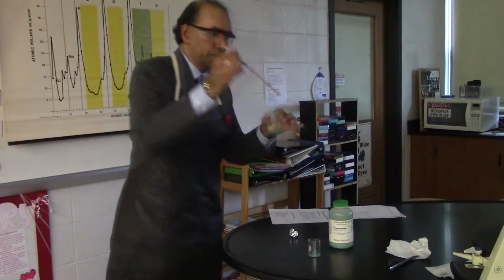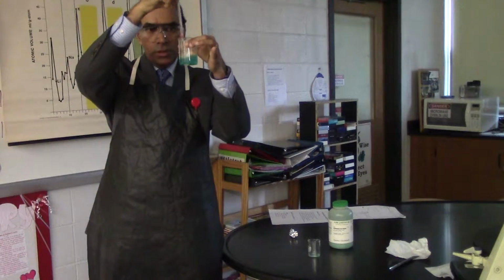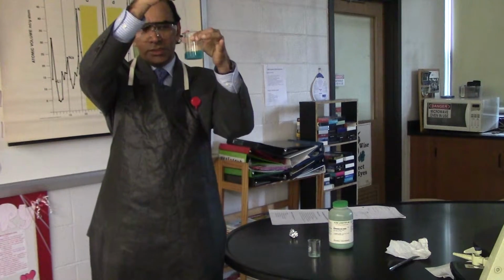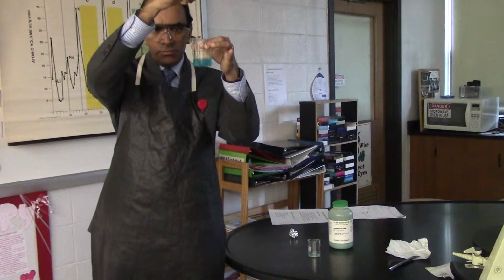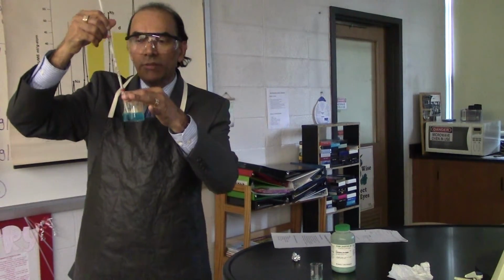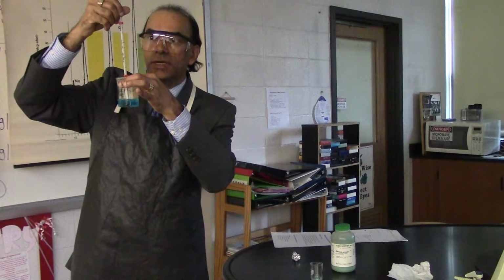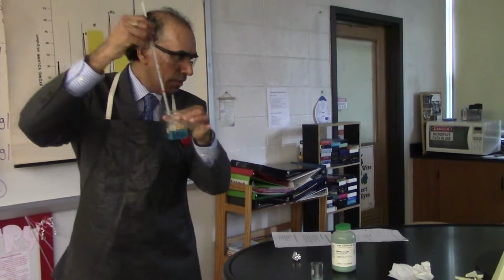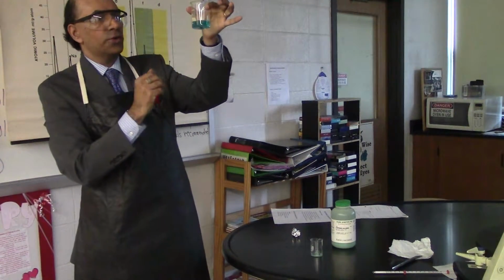Now your third system is a stirred solution, or a stirred mixture. Let's see what happens. So you keep stirring. The color is changing to a different color of blue. That greenish tint has disappeared. Now I'm left with a homogeneous mixture. And I can read the temperature, so you can distinguish between a qualitative observation and a quantitative observation. I'll take a quantitative observation right now. It's 25 degrees Celsius, 25.0 degrees Celsius, if you're studying significant figures. All right, so I have my third system. I study it. Students write down 3 more observations.